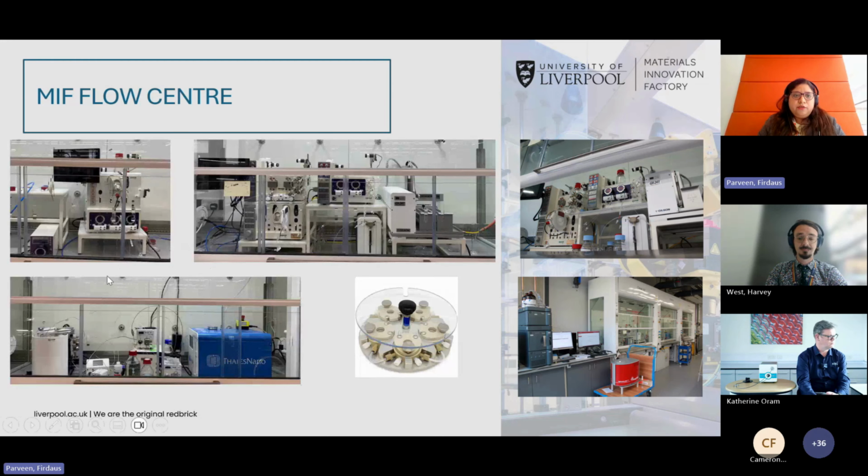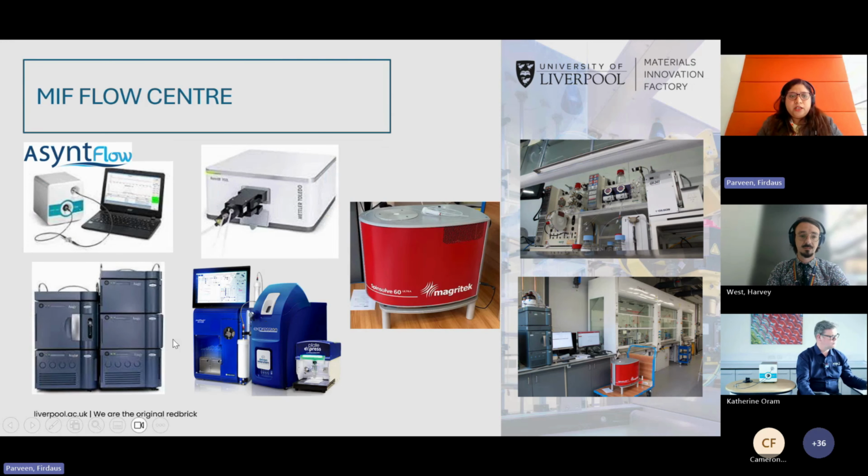At Flow Center, we have different flow reactors, including the F reactor from Asynt, and we have different analytical probes: Asynt Flow UV, Mettler-Toledo IR, different LCs and NMR.